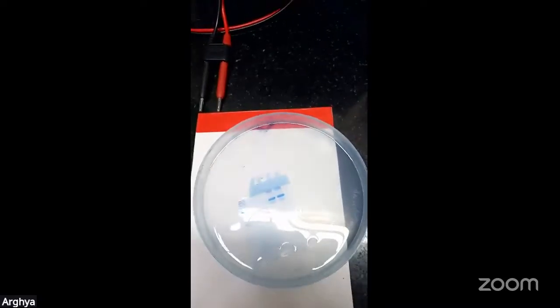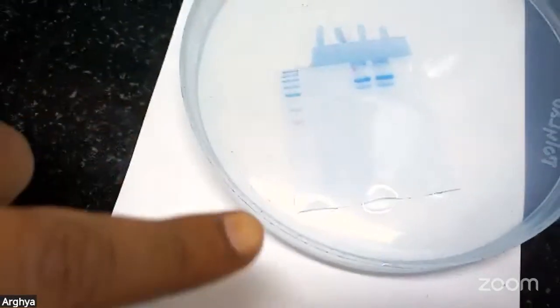There is a marker. These are the standard known markers of known molecular weight.